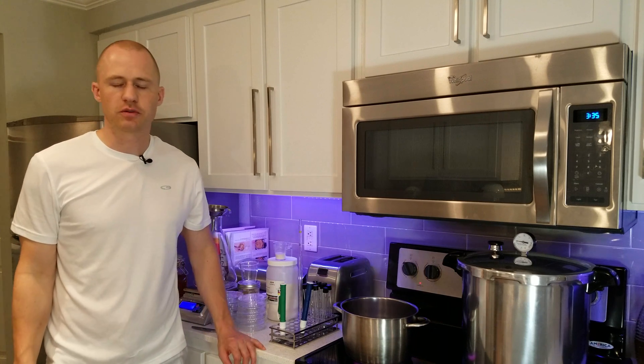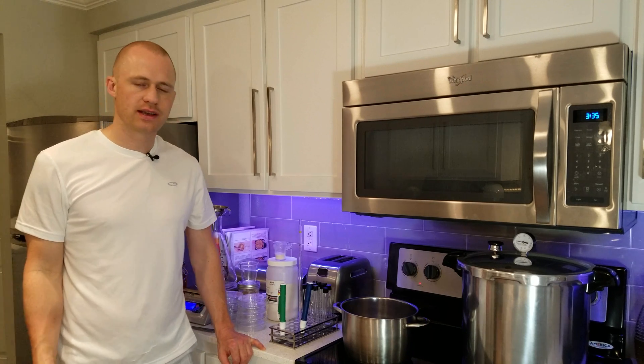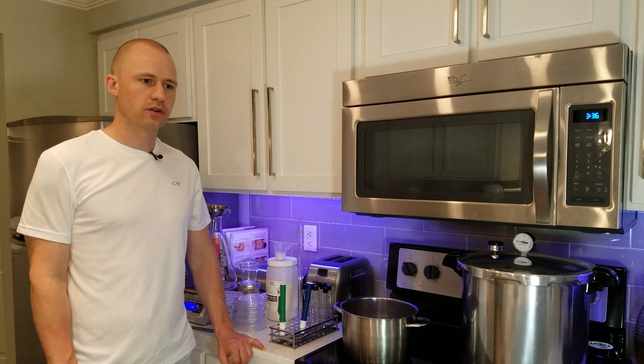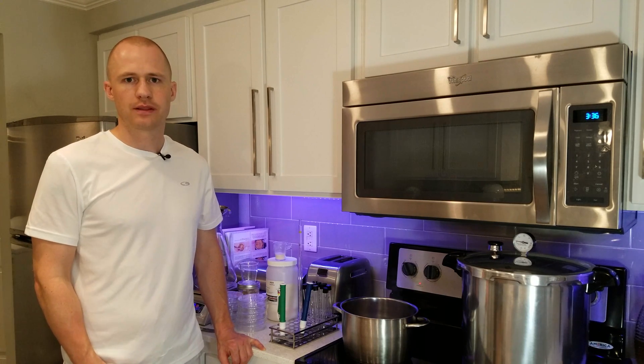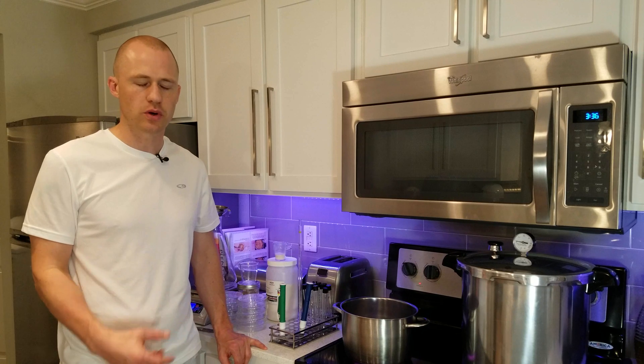Hello brewers and lab nerds. Today I'm going to show you how to make agar plates and agar slants or slopes. It's essentially a gel-like substance that you can grow yeast on. You can also add other things to it that I'll show you in later videos that will make it a selective growth media where it will inhibit certain things and make other things grow.